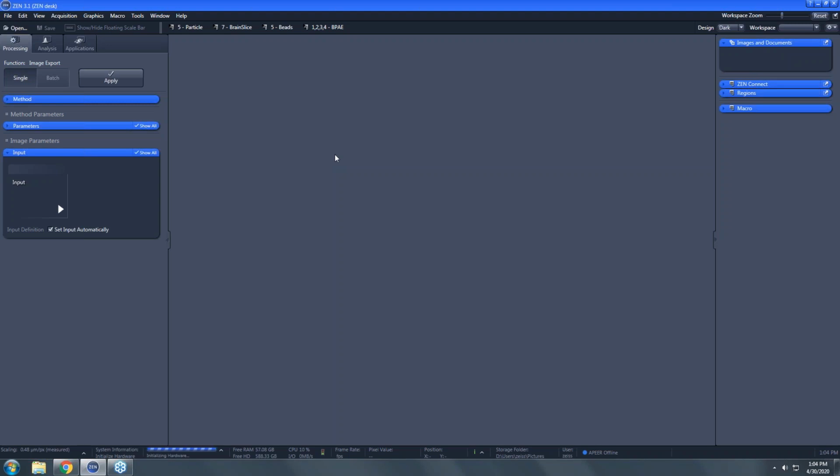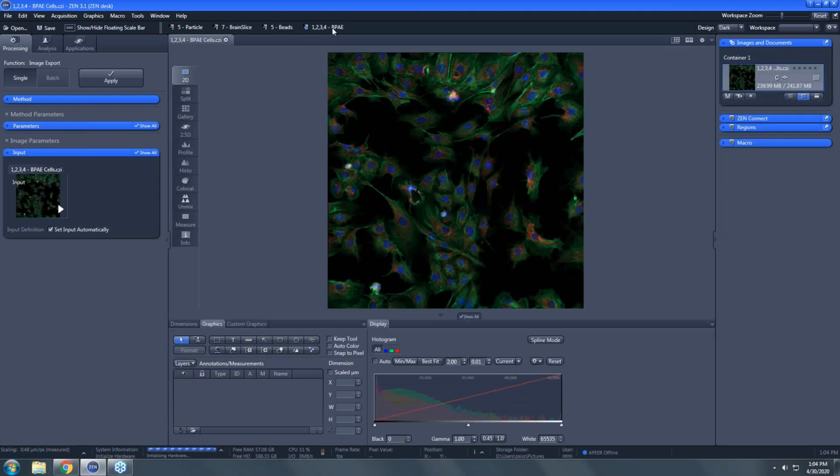We've got some quick buttons at the top here to get our images open as fast as possible so that we're not hunting for them. And that's the first thing that we're going to do: demonstrate what you might want to do when you capture a series of images. So we've done an imaging session. This is actually a 3x3 tiled image, so we're going to use it as the basis for what we would get if we captured a series of smaller images.